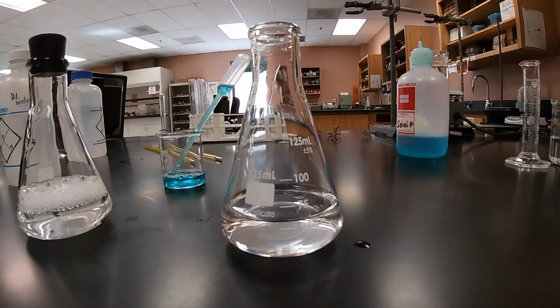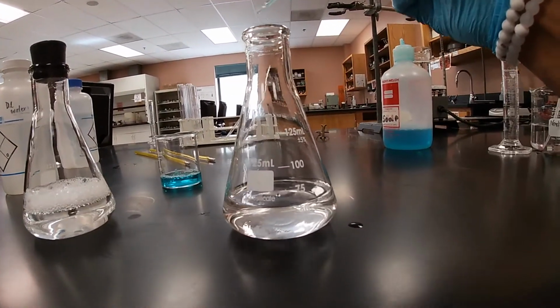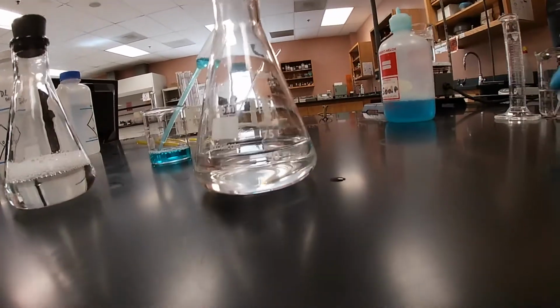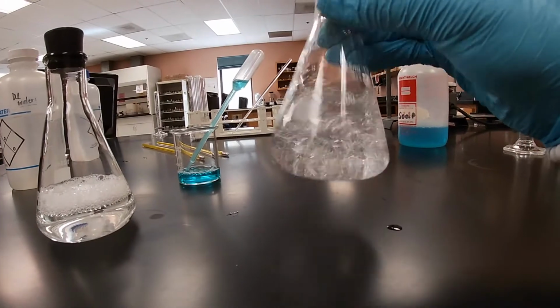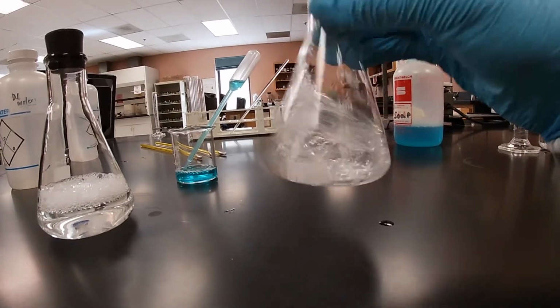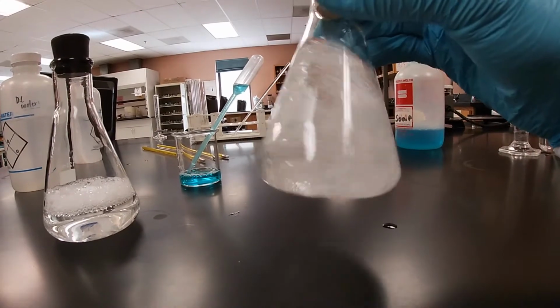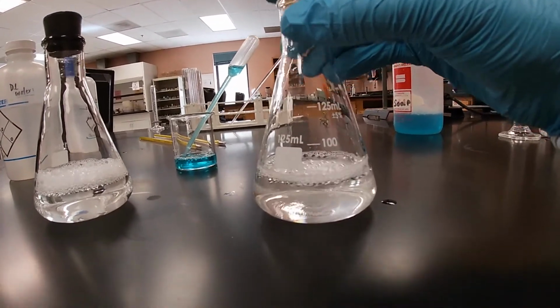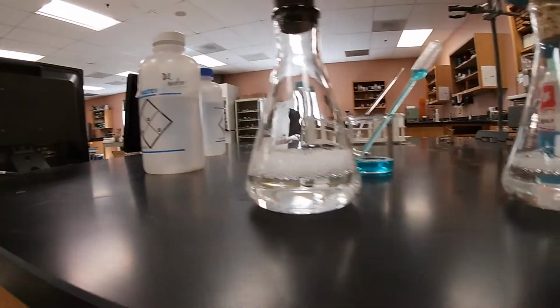And so we'll go ahead and start with our first addition. So we'll go ahead and add 1 drop of soap into our tap water. Go ahead and close it, and then we're gonna go ahead and shake. 1, 2, 3, 4, 5, 6, 7, 8, 9, and 10. And as you can see, definitely not even close to being the same.